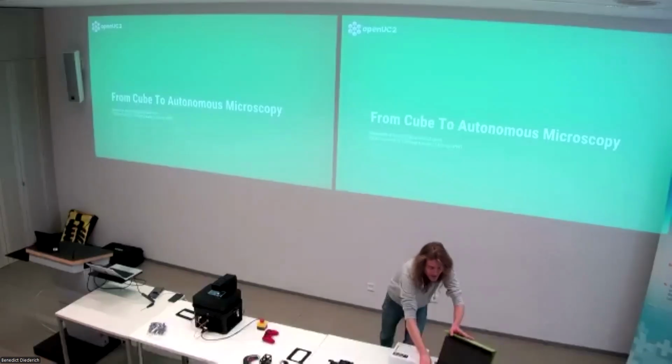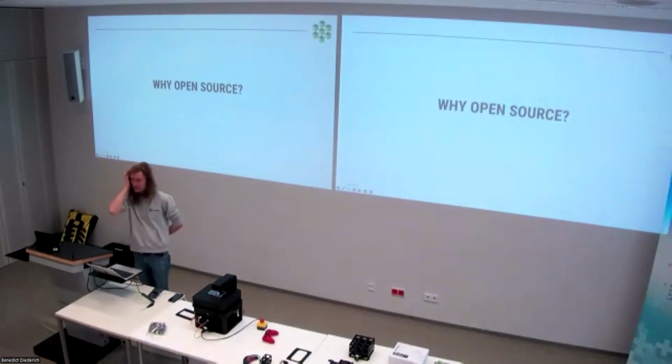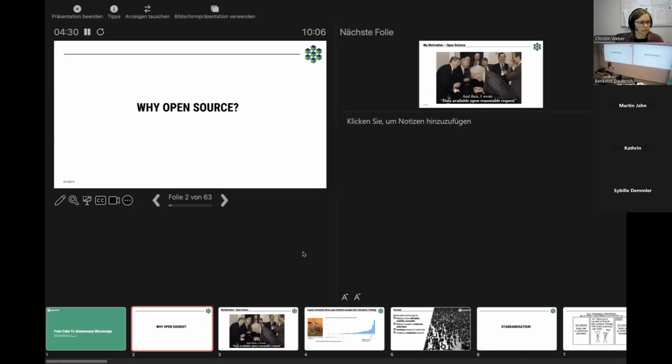I think for those who have listened to my talks, you know what to expect. So, right. Okay, so we have already heard that there's this little thing about open source. So you may ask, okay, why open source? My favorite question is always to the audience: where do you experience open source in your daily life? Just think about it for a second, and where do you think it's valuable for you?